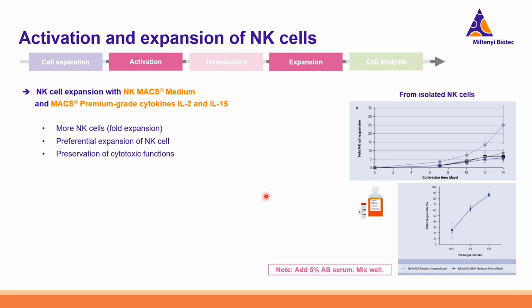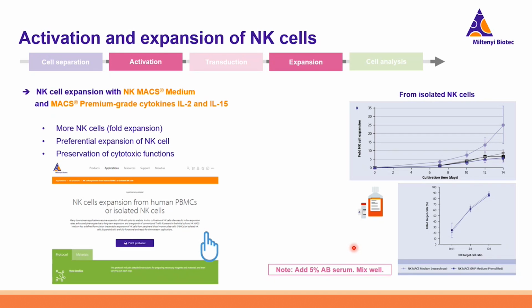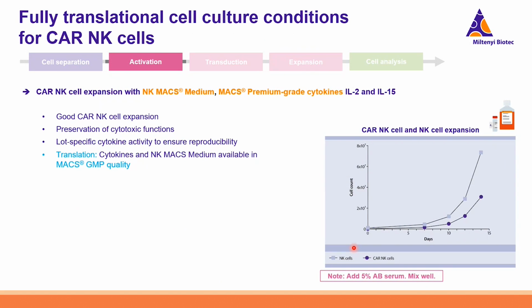And also it has been shown that the NK cells, so now I'm just really talking about NK cells, keep their cytotoxic potential after this 14 days of expansion. And here you can also download the full protocol. I'm highlighting this here because it is very important to have a good activation and expansion protocol for the NK cells prior to the transduction. So the NK cells get activated first and then expanded in the medium.